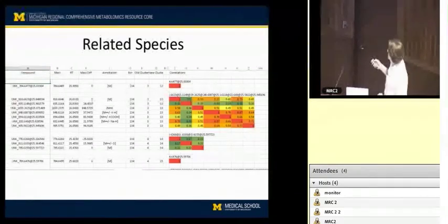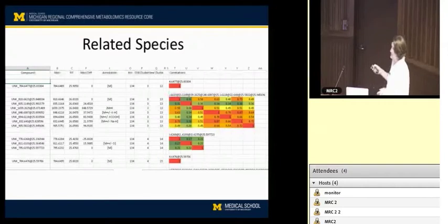So part of my talk I skipped, and I've only got about 2 minutes left, is that we're going to use all that information. We're going to use the fact that we have a very good idea that this is a molecular ion, not some oddball fragment, and be very aware of that. And then if we still can't identify it based on something in our library, or by looking at what the fragments are, obviously you can do MS/MS analysis, where we fragment these peaks and try to do a library match against an MS/MS spectrum.